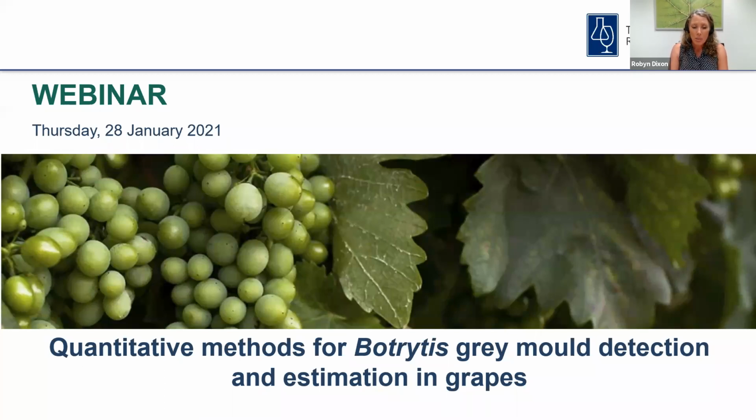In this session, we'll look at quantitative methods to detect and estimate botrytis contamination in grapes.